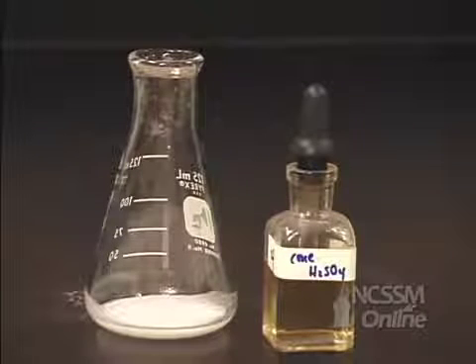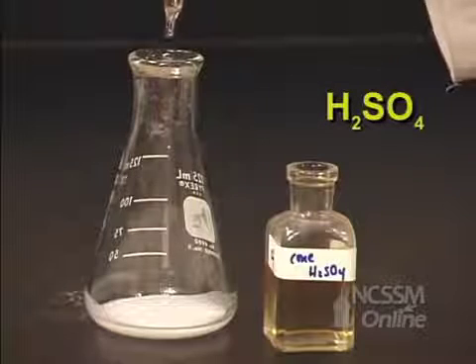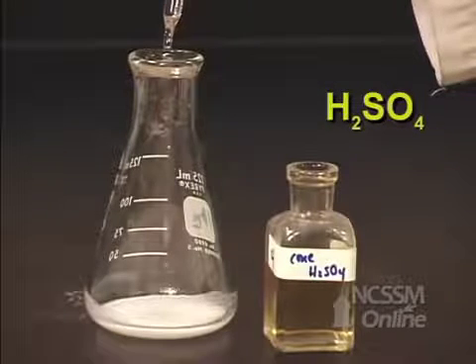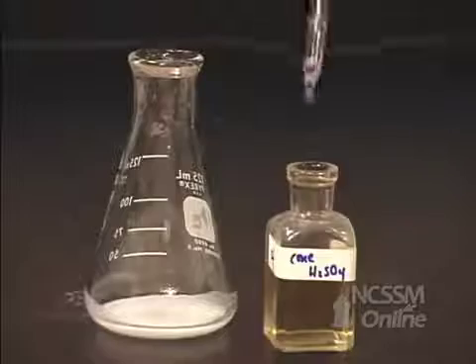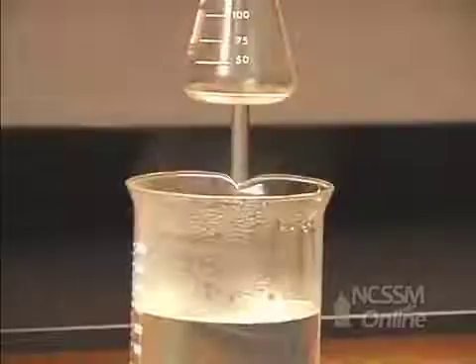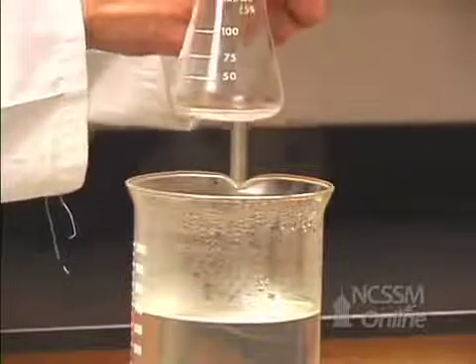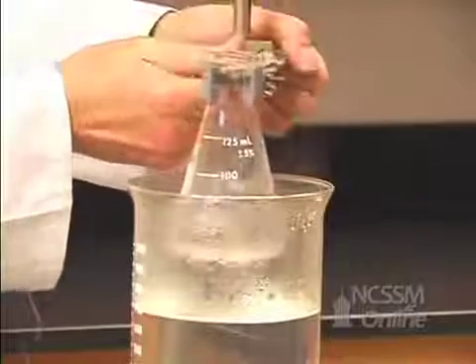Next we add 5 drops of concentrated sulfuric acid. This is making us an acid environment, and it will also cause the reaction to go a little faster. We want to heat this in a boiling hot water bath for about 10 minutes.